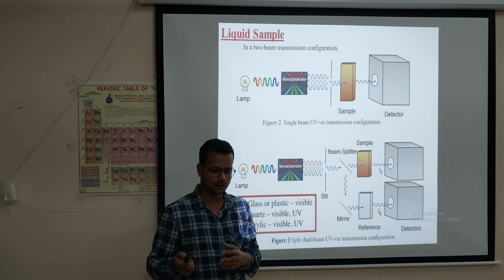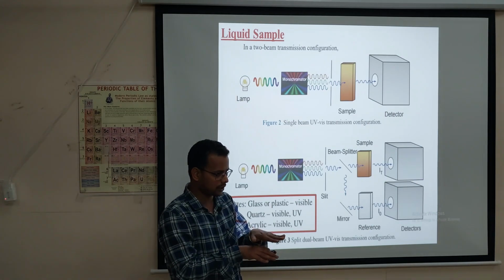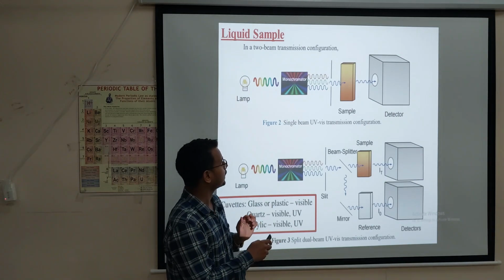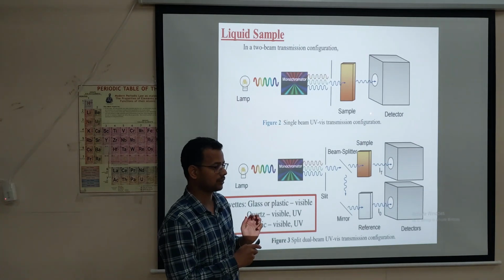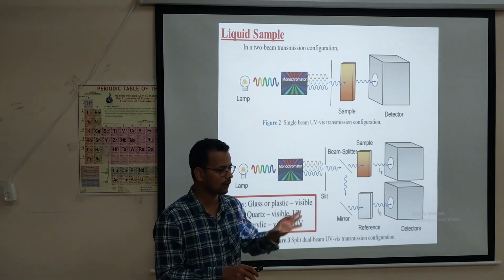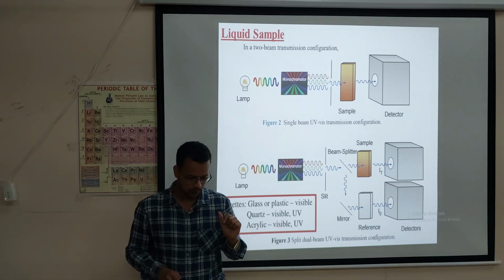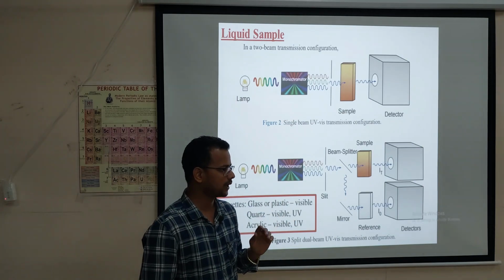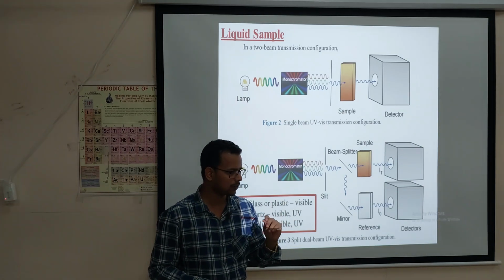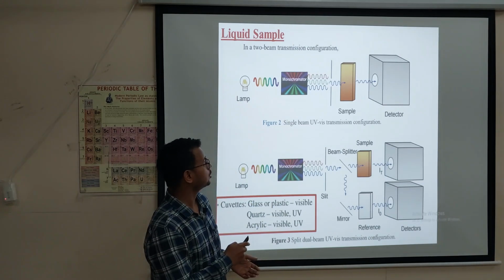So actually what Roshan asked is: if the monochromator just separates different wavelengths of light, and the slit cannot decide which type of light passes through, then what is the role of the monochromator? We take 5 examples: white, black, yellow, red and green samples.